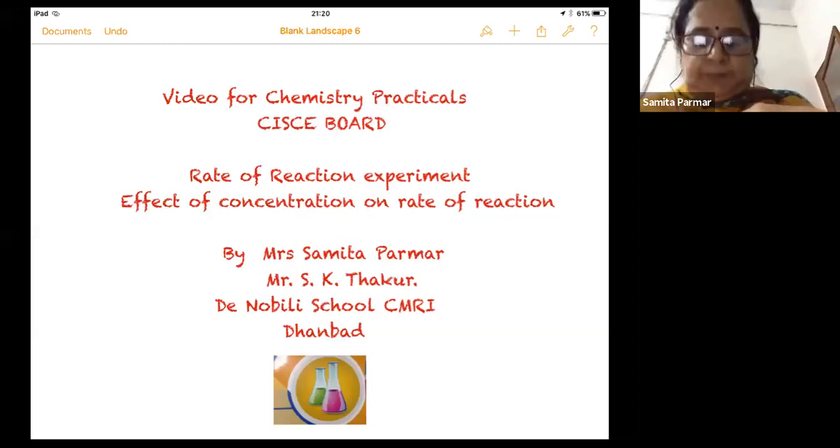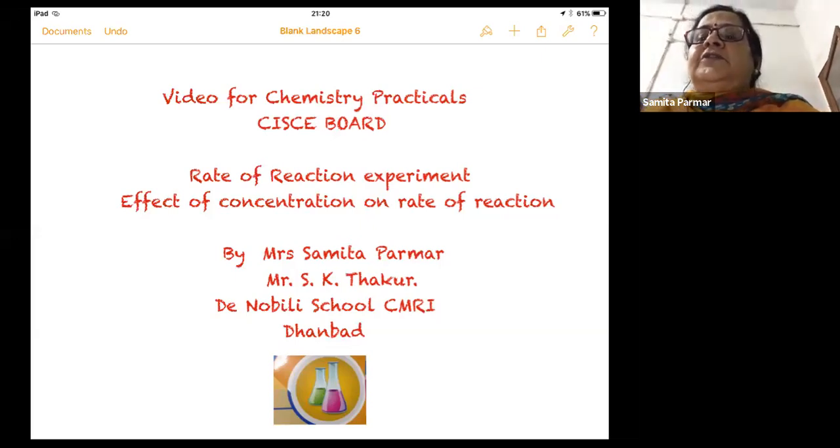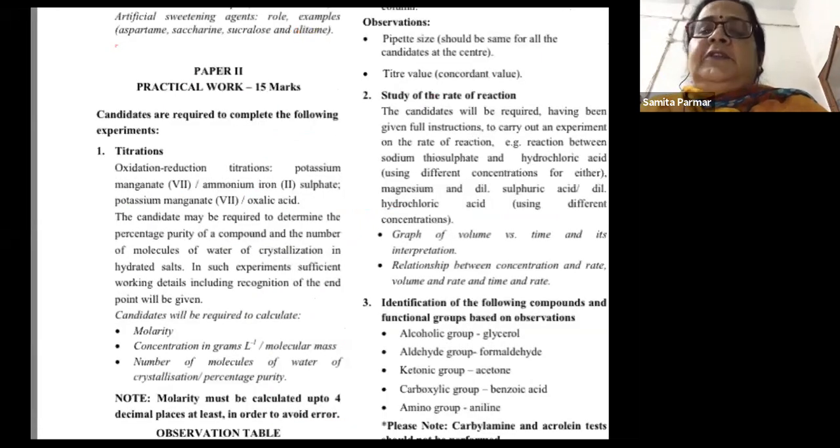Okay, children, welcome to this video on rate of reaction. In this experiment, we will be studying the effect of concentration on the rate of reaction. If you look in your syllabus, you will see that this has been given under topic number 2, where it says study of the rate of reaction.